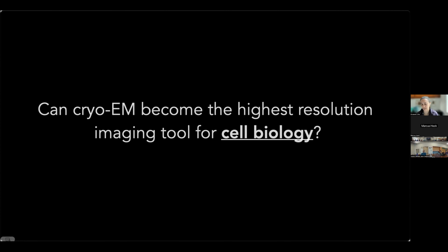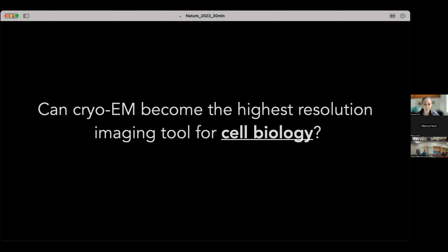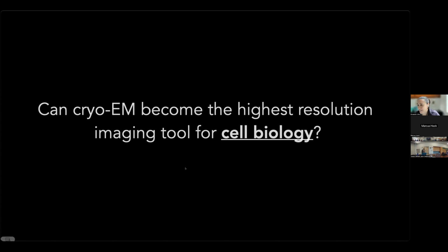So now we know that electrons are the best radiation that we have right now to look at biomolecules, but this doesn't have to be only isolated outside the cell. It can also be inside the cell. And I've dedicated a little bit more than a decade to making this happen, and now that it does, to use it for a diverse set of fun biological problems.